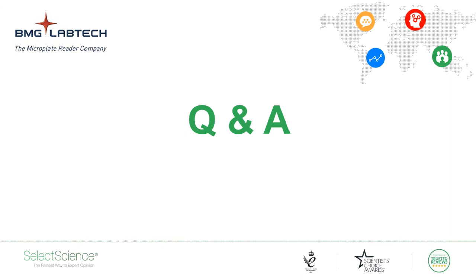Lovely, thank you. The next question is, which reducing agent do you routinely use for IC50 Shift assays? There's no hard and fast rule over which reducing agent we use. We tailor it to each target. We do try and avoid the reducing agents that contain thiol groups, and so if possible we'll use TCEP when we're working with covalent inhibitors, but not all enzymes tolerate that, so it's on a case-by-case basis, and it's important just to bear in mind the other effects that might be occurring in the well at the same time.